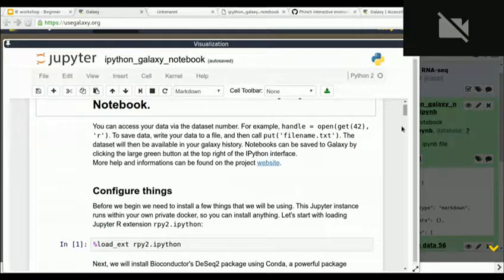So if you had a class and you were teaching Python with the Jupyter Notebook, and you were using Galaxy to work, could you kind of impact that? So you had 40 people in your class. So we have our own instance where we're using that. But you could use Galaxy. I don't know how many instances of your Jupyter Notebook you can start. It's surprising that it works for all of them. This is really awesome.